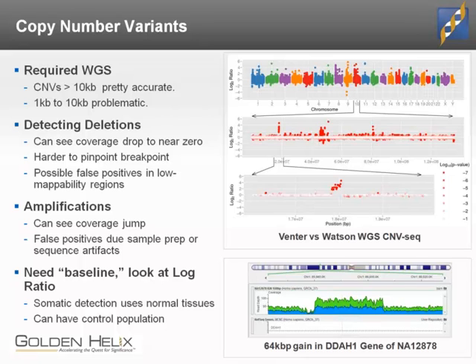CNVs, won't spend much time on here, but you can detect CNVs in sequence data, especially if you have whole genome sequencing. It seems to work a lot better there. We get questions all the time from people who say, can I detect CNVs in my exome data? And there are methods out there for doing it. I'll say that some are more successful than others. I'm not sold that that is a solved problem yet.